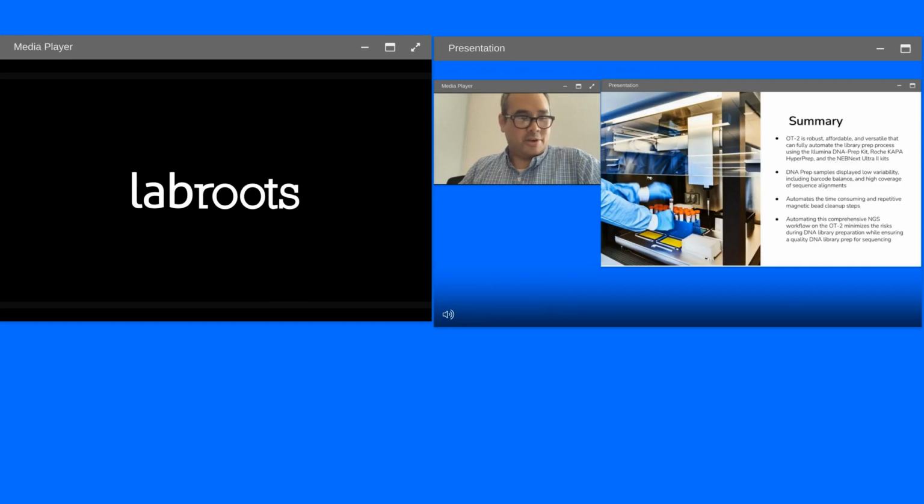And there you go. I hope you got a good walkthrough of the OT-2 and what it's capable of, and how we approach automating the Illumina kit, the HyperPrep, and the NEB kit. I was quite happy with the data. The DNA prep samples had low CV, sequenced very well.